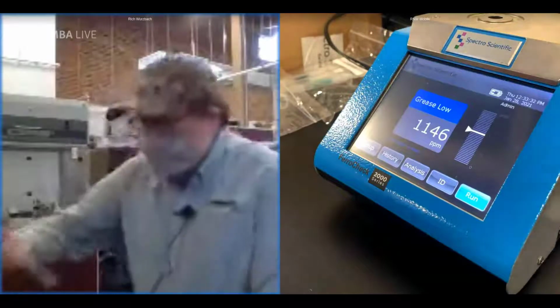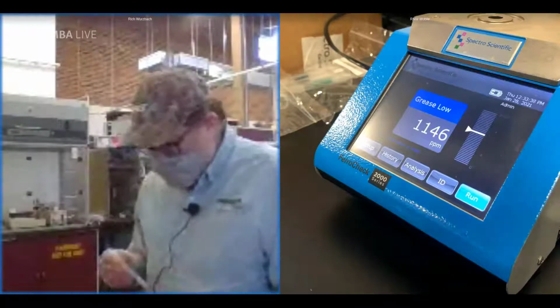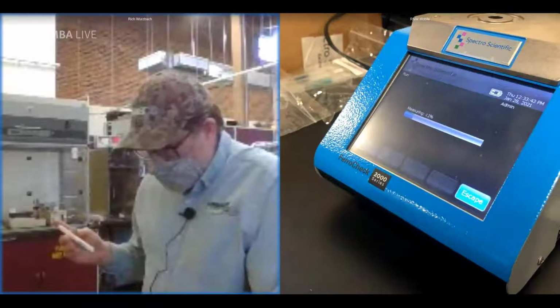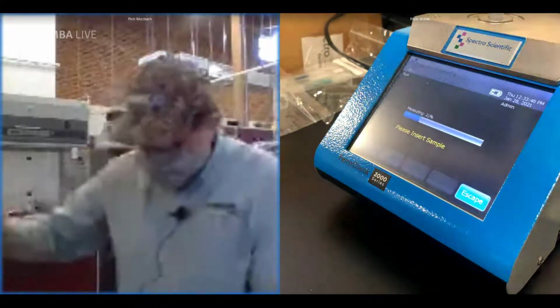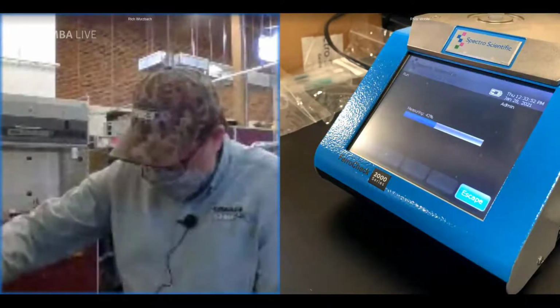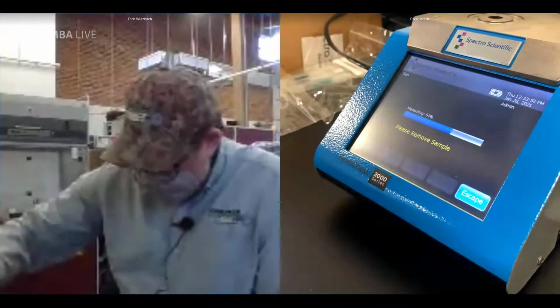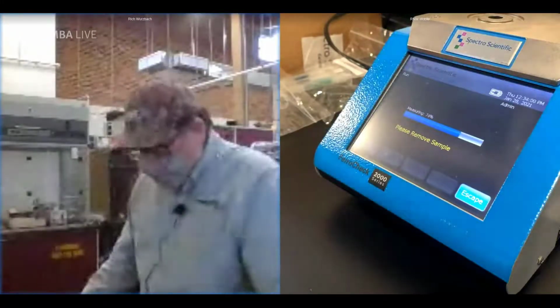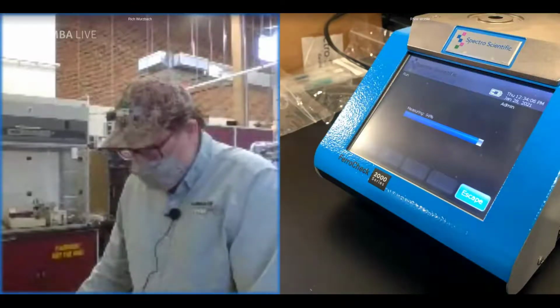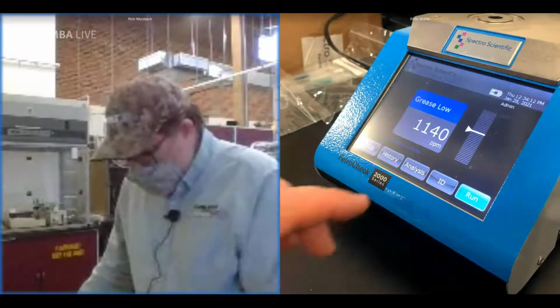So there is a standard here that I can use, and it already has the concentration printed on there. I would hit the run button. It does a background timing circuit, and then I have to be ready to insert that fairly quickly after it gives me that warning. It goes through a measurement protocol here, gives me another warning to remove it, and then it goes on with its measurement. And this particular sample that I put in here is a little over 1,000 ppm, and that's the measurement that we expect out of this device. So good confirmation to what I knew was being put in there.